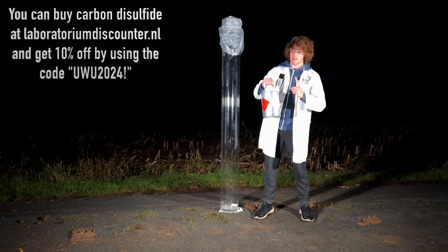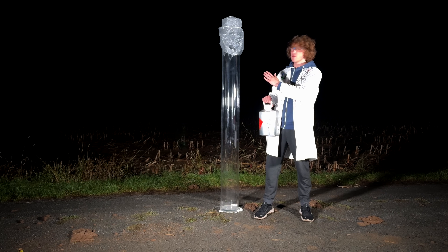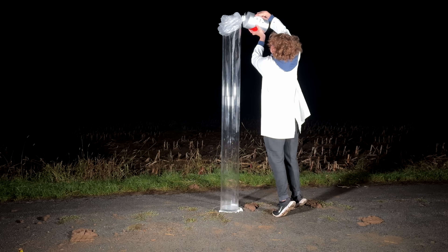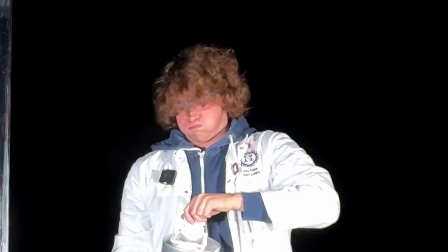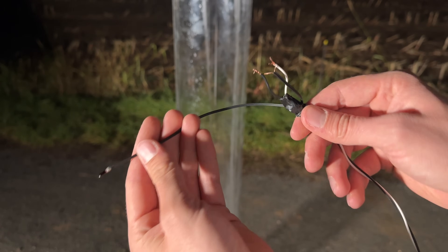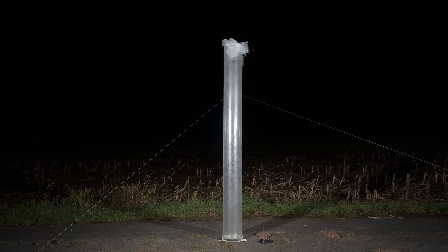Carbon disulfide is neurotoxic, which is why I'm going to employ the Indian method while filling it into the tube, which is holding your breath. That's more than enough. The tube may explode, and I would like to keep my fingers, so remotely detonating with an electric igniter is ideal.